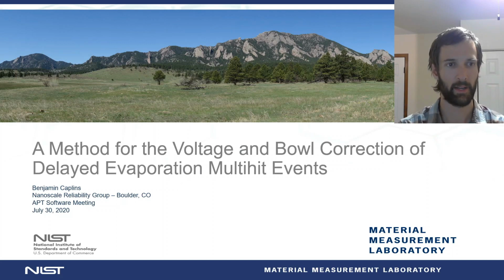Today I'll talk to you about a method we're developing for the voltage and bowl correction of delayed evaporation multi-hit events.